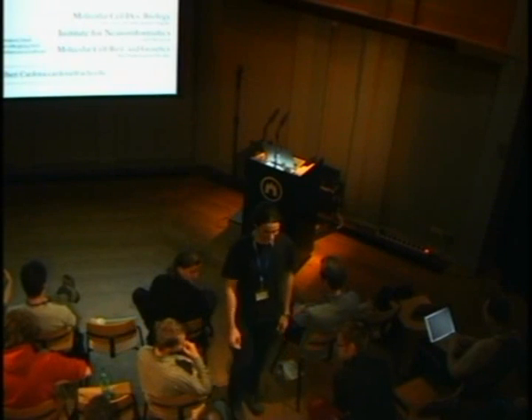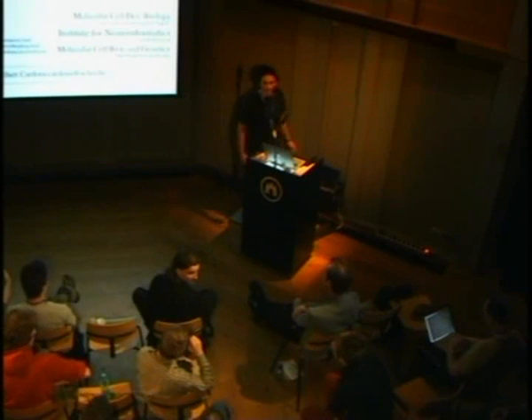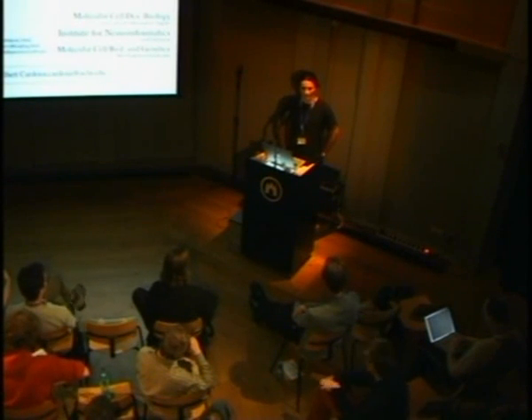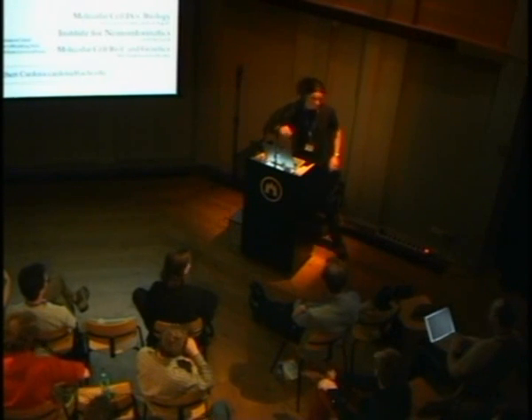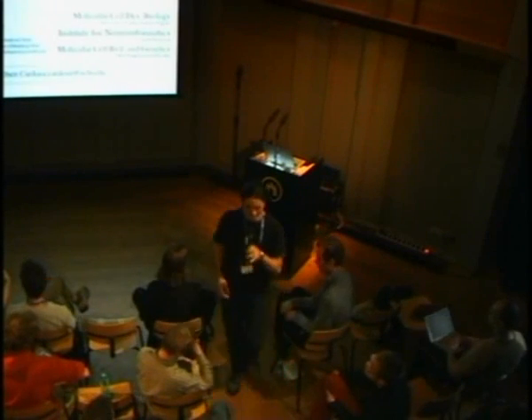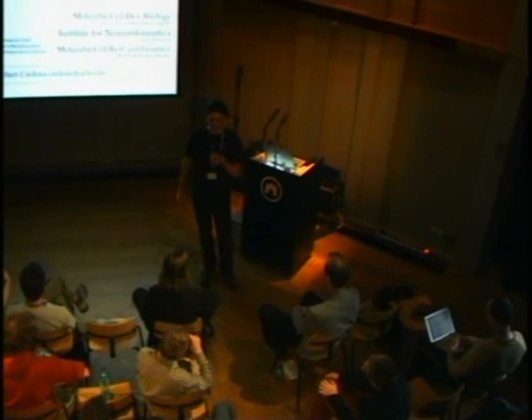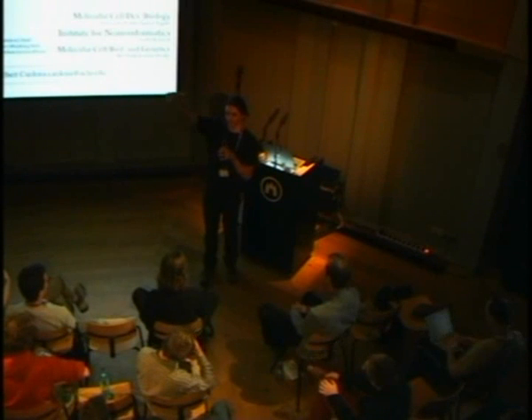Can you tell something about your image data? Are you using only the MRI images, or do you use multimodal images? Well, these sequences of images mostly are from confocal imaging. Confocal is this laser scanning microscope that has basically an iris, a pinhole.